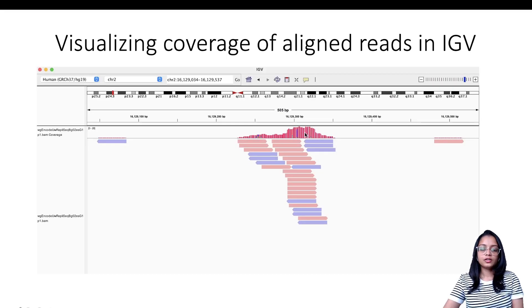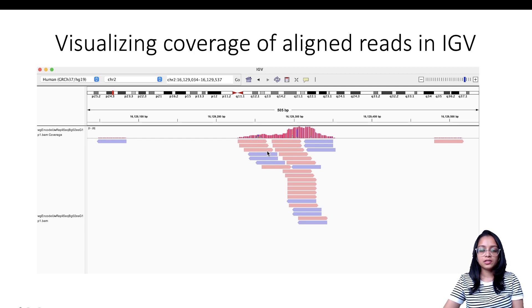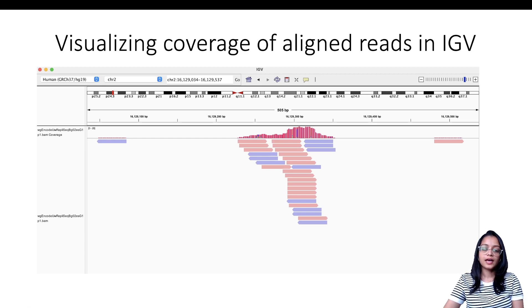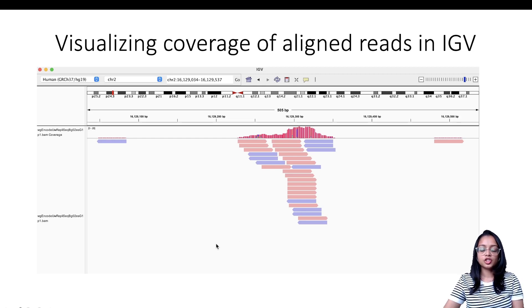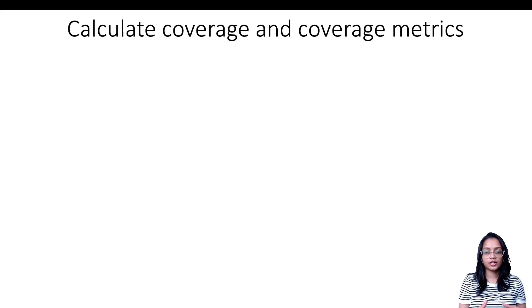Here we're visualizing reads aligned to a part of the genome in IGV — the Integrative Genomics Viewer. Each segment shown is a read, and the direction of the read indicates which strand it aligns to. Coverage is visualized in pink, and you can see that certain regions have higher coverage than others. You can use a genomics viewer like IGV to visualize your aligned reads and coverage.